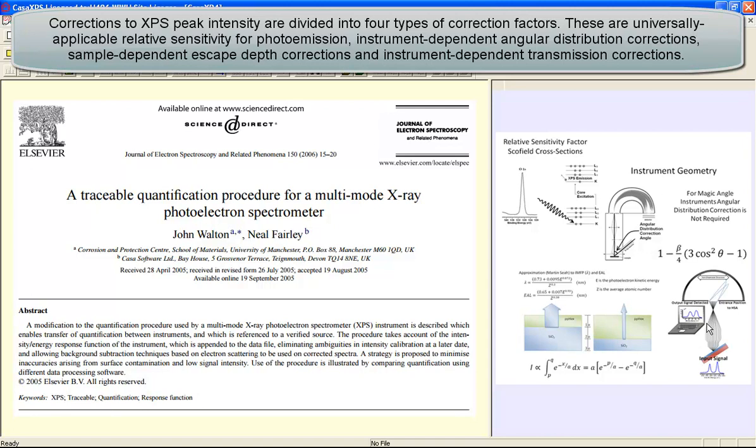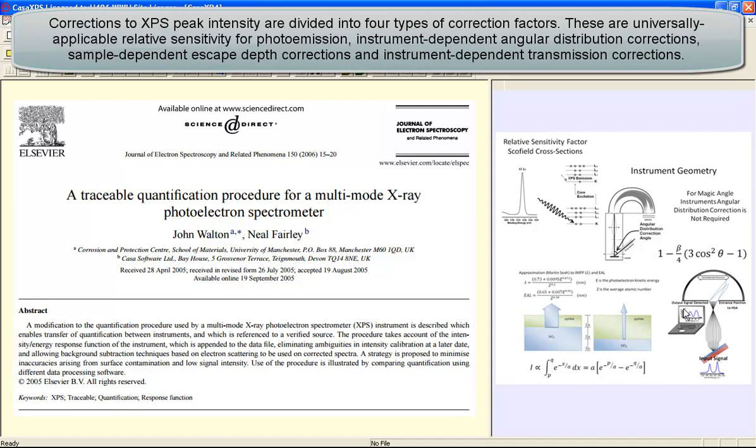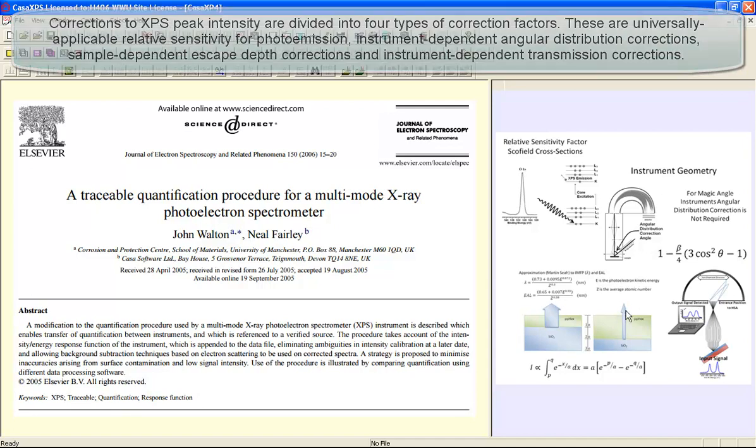And then finally we have the transmission characteristics. The transmission characteristics describe how signal originating at the sample moves through the analyzer and is recorded, and how this might vary as a function of kinetic energy once again. So we have at least two operations here that depend on the kinetic energy of the electrons, and this is why the magnesium oxide is a good example which tests these corrections.